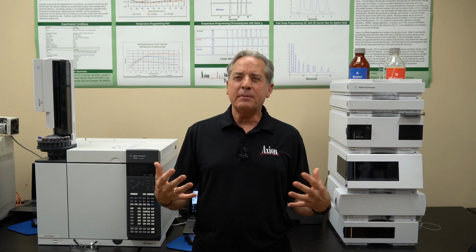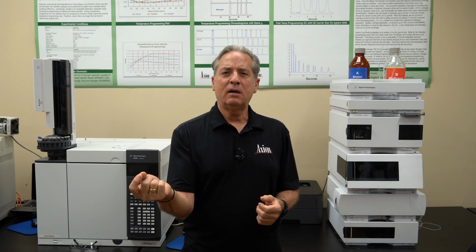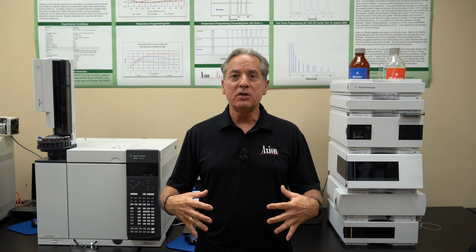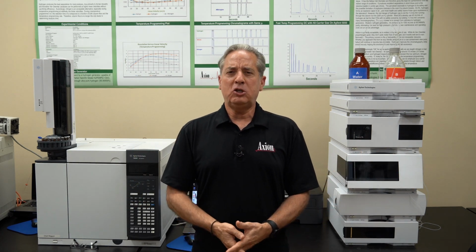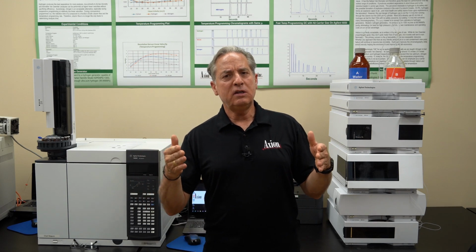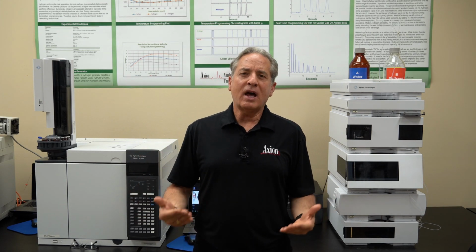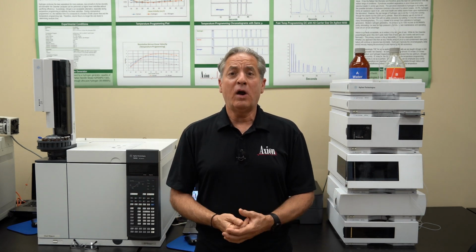We have a fun lab set up where we do trace drugs in a sample. But that same application, that same set of skills is used for any trace analysis. So if you switch to GC mass spec, you go to the splitless injection technique, and then you add in SIM for selected ion monitoring, you get a huge boost in your sensitivity for analysis.